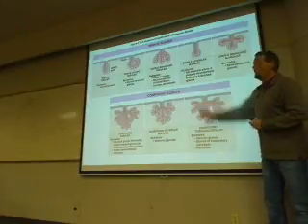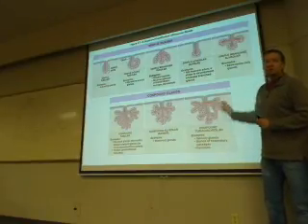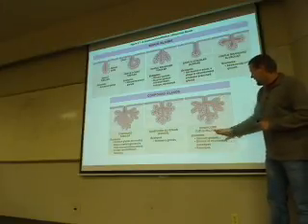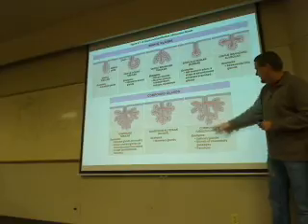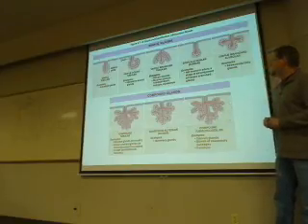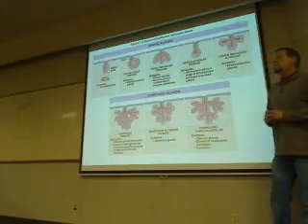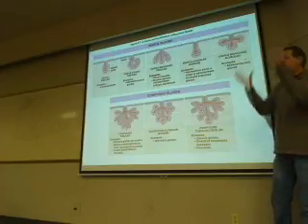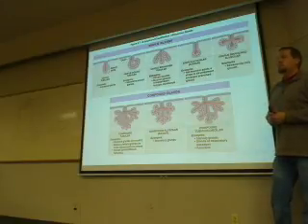Your pancreas is dominated by these structures, and in the pancreas we call them pancreatic acini, because they're actually tubular and alveolar, but when we look at them, we see a lot of these, so we call them acinar cells. So are the alveoli in the lungs named for the alveolar shape? Mm-hmm. Yeah, that rounded sort of shape, exactly.